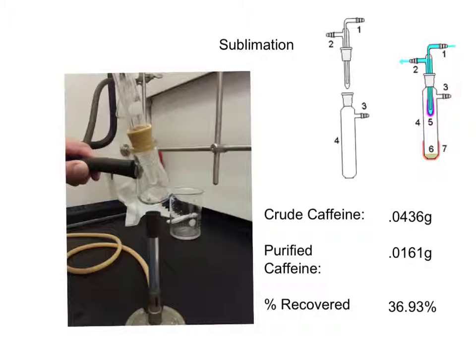And the way we accomplished this was through 2 conditions: high temperature and low atmospheric pressure. The way we lowered the atmospheric pressure was through a vacuum. We connected it to the flask, we sealed it up top, and turned on the vacuum. This lowered the atmospheric pressure, which allowed the sublimation of the matter to be reached.